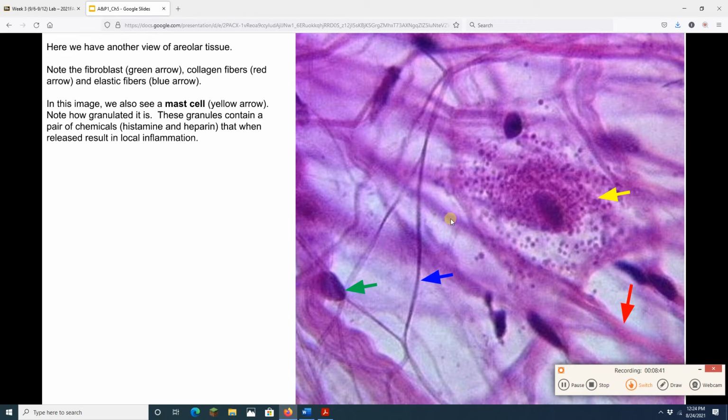We are also able to see those fibers here. Here is a beautiful elastic fiber right there. Look at that guy. That is an elastic fiber. Here's another one right here, another one over here, one right here, one right here. There are a lot. Now, not only can I see elastic fibers, I can really nicely see some collagen fibers. In fact, I kind of like the collagen fibers on this picture better than on the previous one. Here's a nice collagen fiber up in the top right-hand corner. Here's one kind of in the lower left.